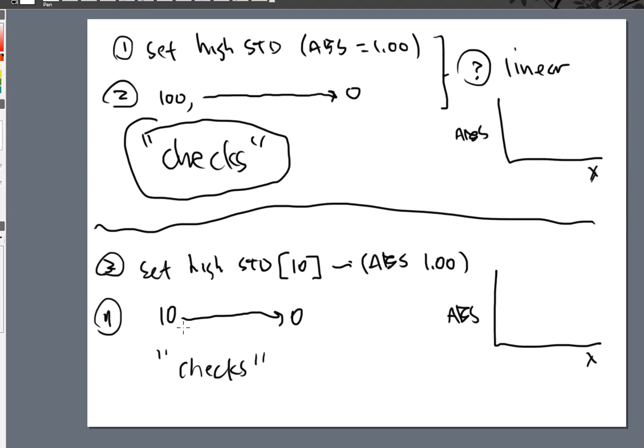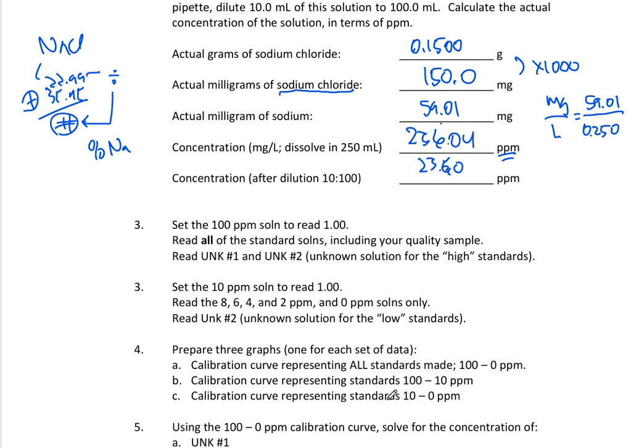So some of these will be things that maybe you prep, or there'll be things that we will prep, and we'll put that number into the spreadsheet and allow you to solve for some errors and to look at how the instrument is performing. All right, so that's what 3 and 3 are going to say.